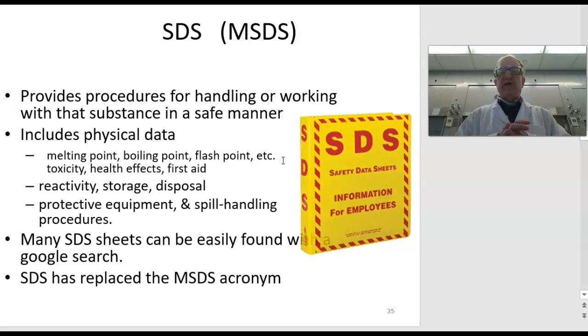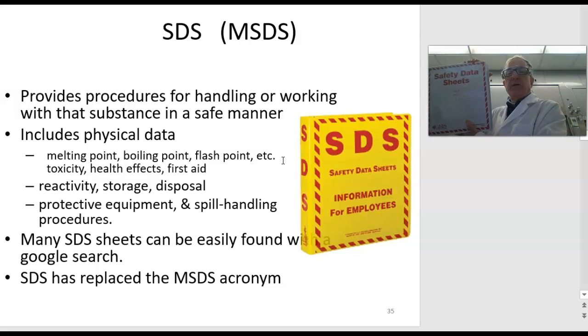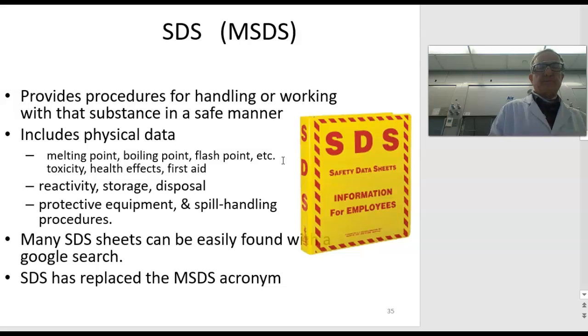You can find SDS sheets with a Google search. Our inventory system, when you call up the substance, will link you to the SDS. And then in the lab, you'll find a notebook with hard copies of the SDSs. So that's a little bit about labeling and about SDSs.